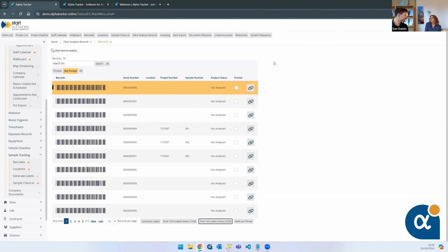That's something that we have to add if you haven't got it on there, isn't it? We have to put it into Tracker Mobile, so when you're capturing a sample, you get that field. Yeah, absolutely. You tap in that field, and it uses the camera on your phone or your tablet, and you scan the code. That's it. And then what that'll do is read the barcode, associate that with the sample that you've just taken. And then when you send in the data, those two get joined together and that barcode is married up with that particular sample. Hope that makes sense.